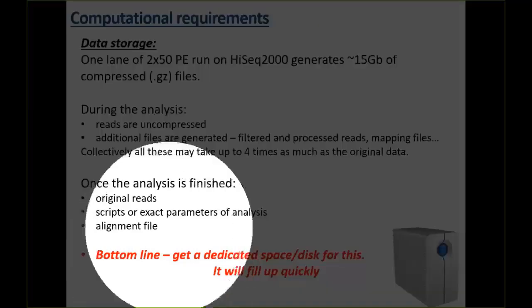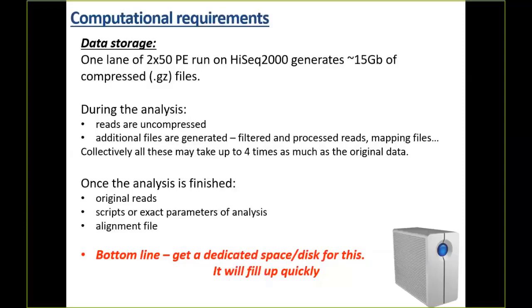You'll want a copy of the scripts and parameters you use for your analysis. Storing this is easy. It's usually storing a couple of text files, essentially, some computer scripts. So this takes up a minimal amount of space, but you always want to have this saved because that's going to describe the process of how you went from your untouched original sequence file all the way out to an alignment and all the way out to the figures in your paper.